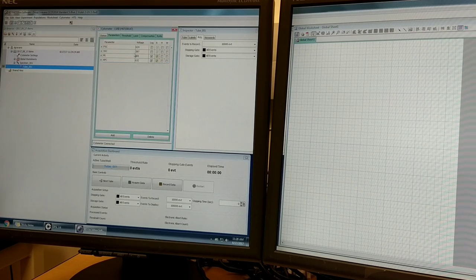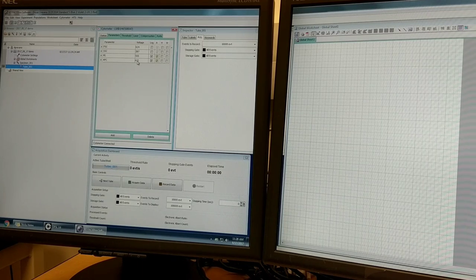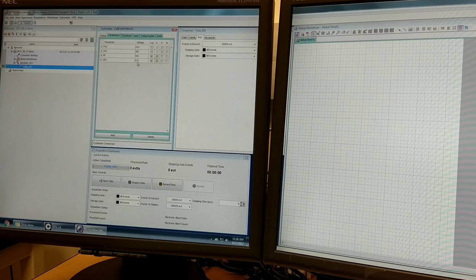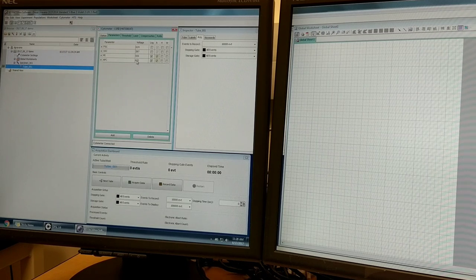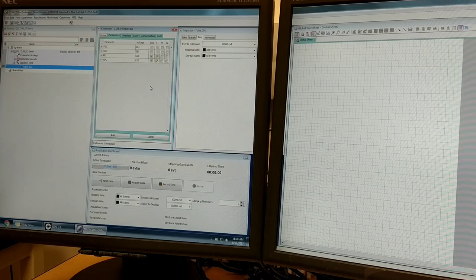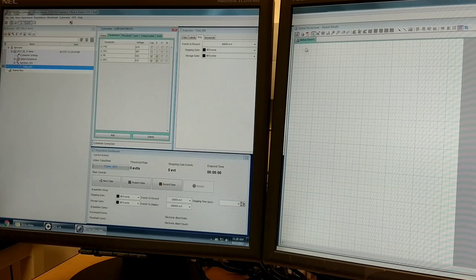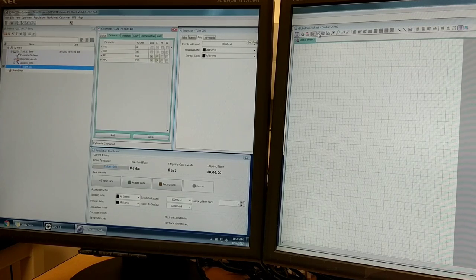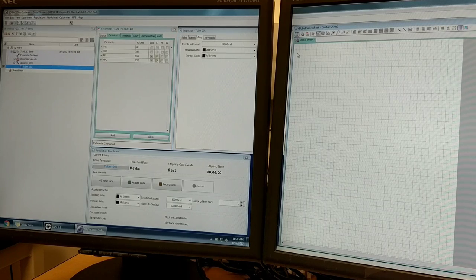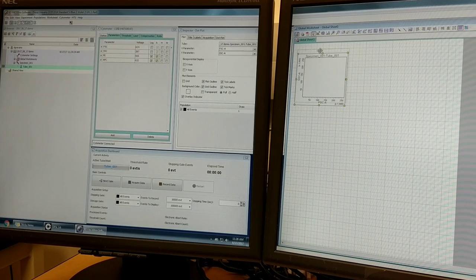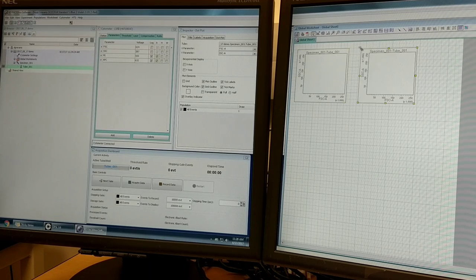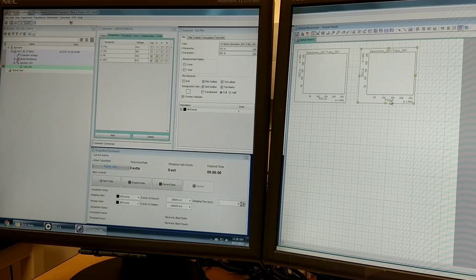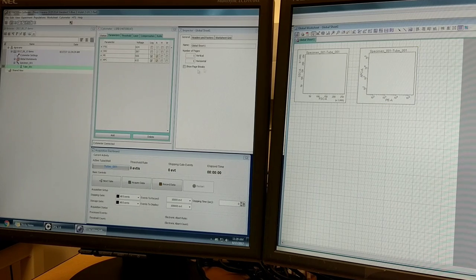I'm going to select PE and press add again and select APC. Now it's got some starting voltages that the machine thinks are optimal based on calibration beads. We may have to change these values, but for now we'll start with the defaults. The next thing we'll want to do is come over to the worksheet and make some plots. I'm going to click on this dot plot symbol and visualize forward scatter versus side scatter. Then I'm going to make another dot plot and look at PE versus APC.